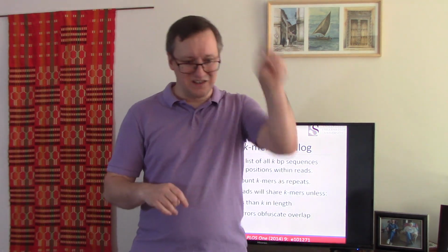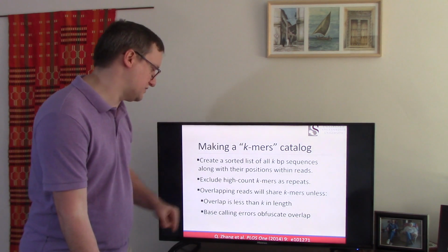Now, it's not going to be there interfering with your production of contigs. Because it was so popular, it represents this junction point that allows you to hook together basically any two parts of the genome. That's not okay. So we can throw those out.